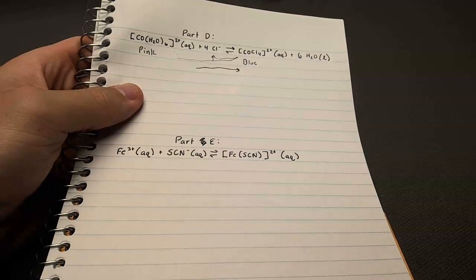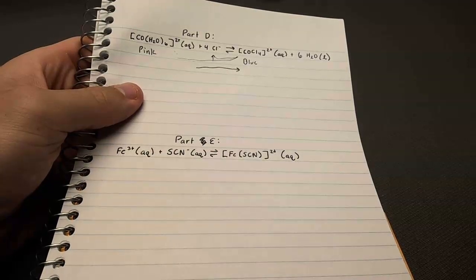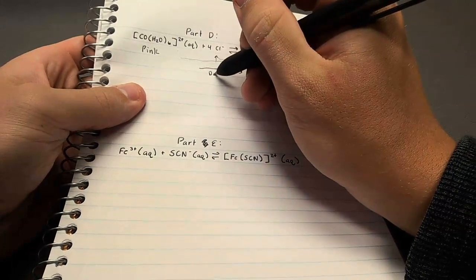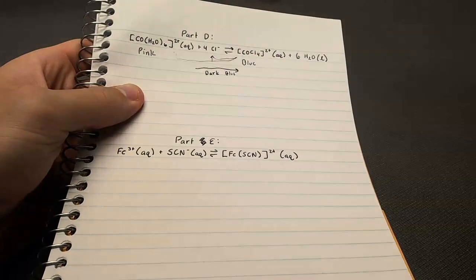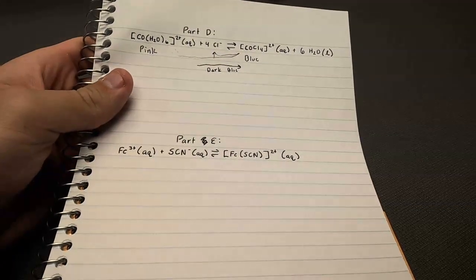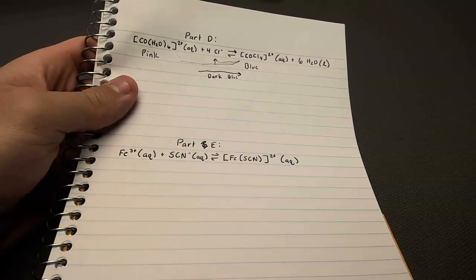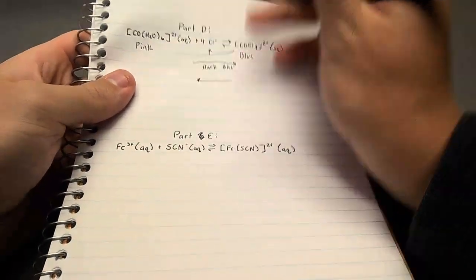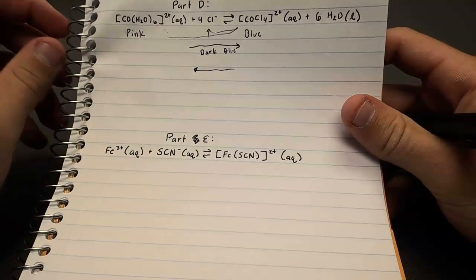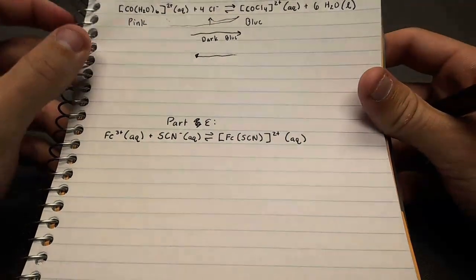Now, when you add heat to this solution with the HCl, the heat added causes the shift right again, making the solution a darker blue, which means that the more reactants you add, the darker the product is going to get. And when the solution loses that heat, it actually goes back to a light pink, causing a shift left of the equilibrium, which would make this an endothermic reaction because the heat causes a darker color.